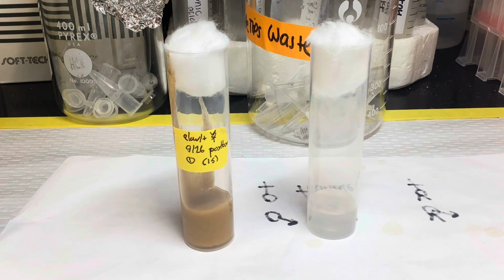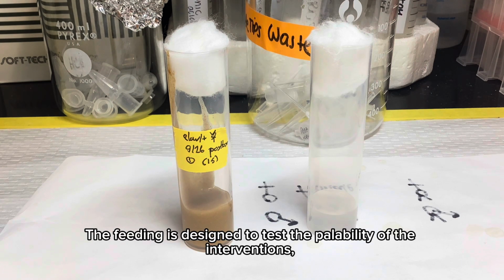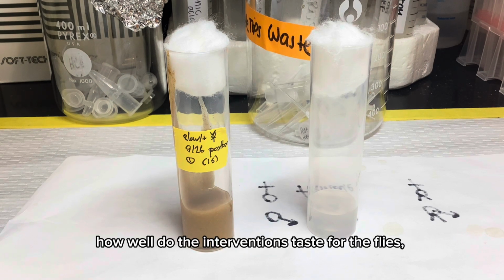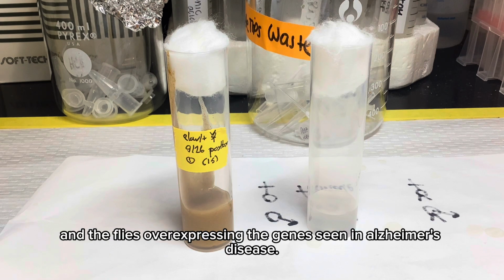So let's begin. To start, I'll be talking about why we conduct the feeding. The feeding is designed to test the palatability of the interventions, which essentially means how well do the interventions taste for the flies. And this includes the control flies and the flies overexpressing the genes seen in Alzheimer's disease.